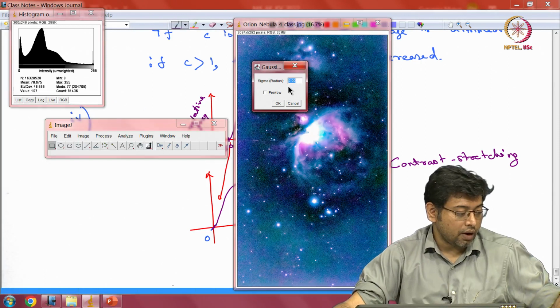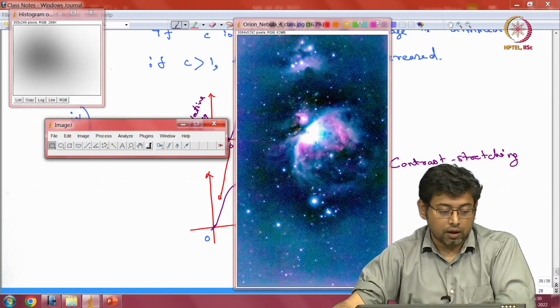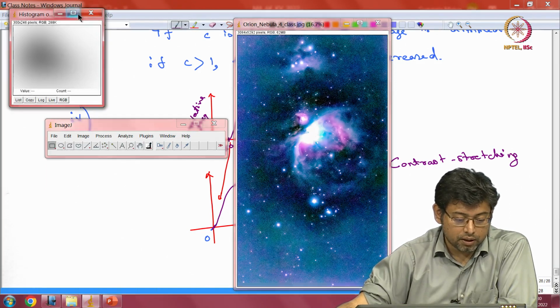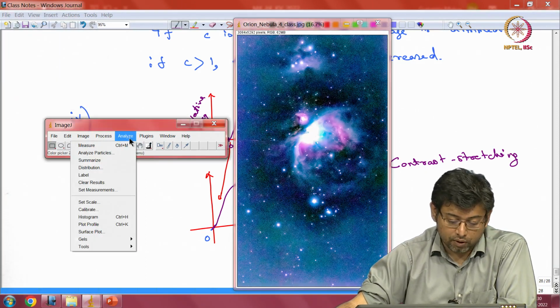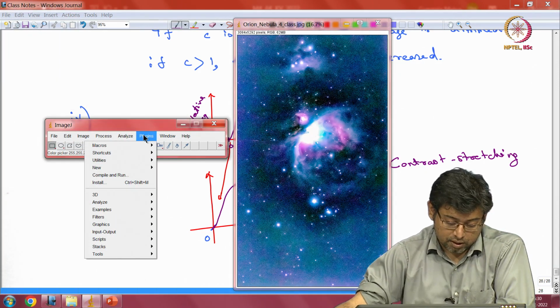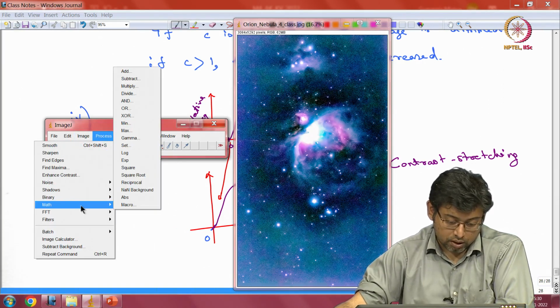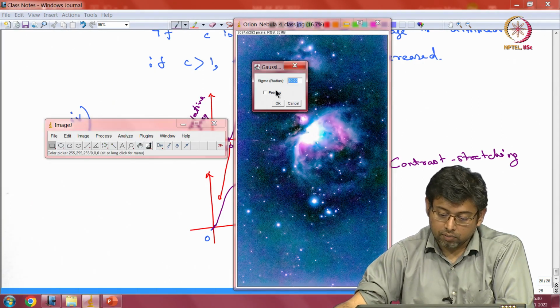So if I try to do a Gaussian blur, let's say 50. It's showing up here. I don't know why I tried to do a Gaussian blur there. No, it is under math. Yeah, sorry. Gaussian blur.